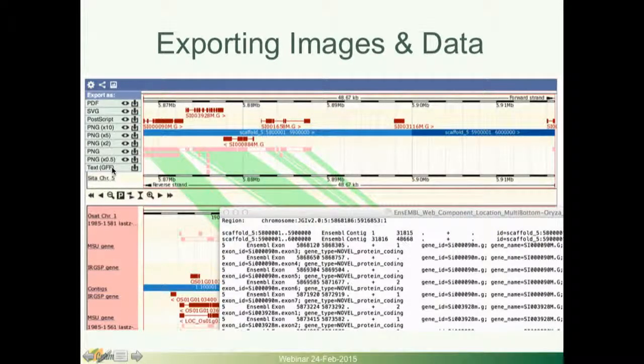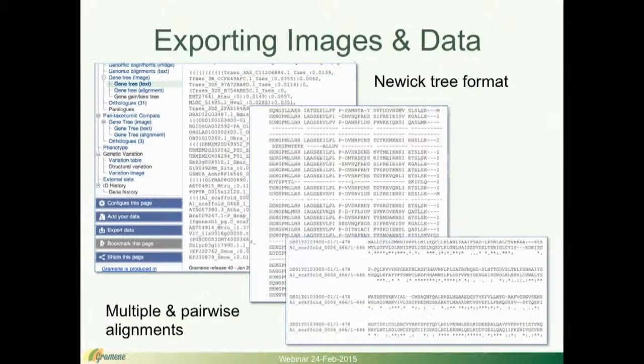You can also click on GFF, and a GFF text file, a genome feature format file, will download that reports basically all of the information that's in this view, including the gene annotations, where the alignments are. If there are SNPs in the view, it'll report those. So basically, anything that you have brought up in the browser, in the tracks, you can actually get the data for where it actually is in the genome. So that's extremely useful if you actually want to study what's going on.